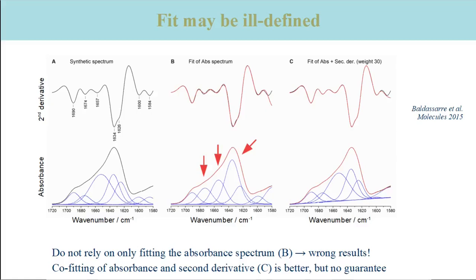Now we come to a problem that may have rather severe consequences. A fit to the absorption spectrum is often not very well defined because the spectrum is rather featureless. This is particularly problematic when many component bands are fitted. This slide shows what can go wrong, and that you should not blindly believe a fit however good the result looks. The bottom spectra are absorbance spectra and the top spectra are second derivative spectra. The starting spectrum on the left is an artificial spectrum where the component bands are exactly known. Panel B in the middle shows a fit to this absorption spectrum, and surprisingly the original set of component bands is not reproduced by the fit, which demonstrates that the best fit is not well defined.